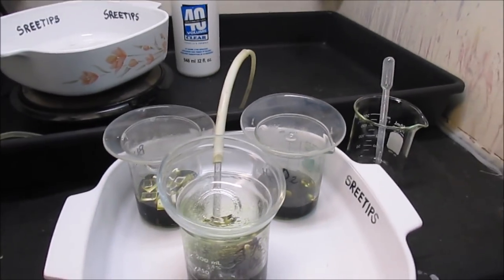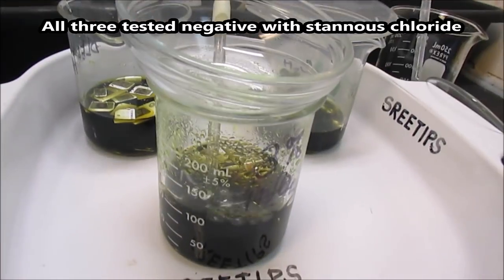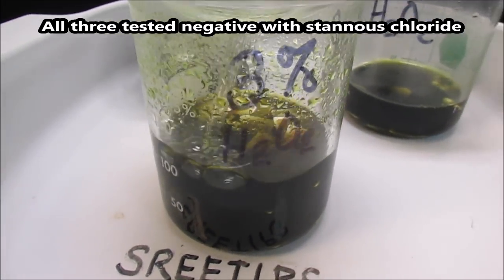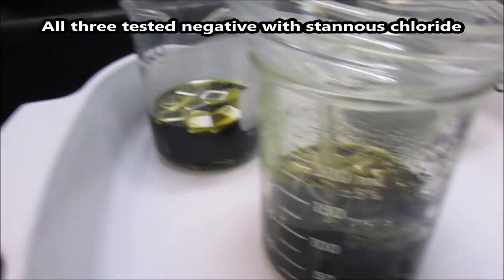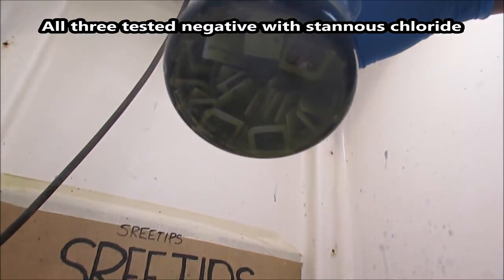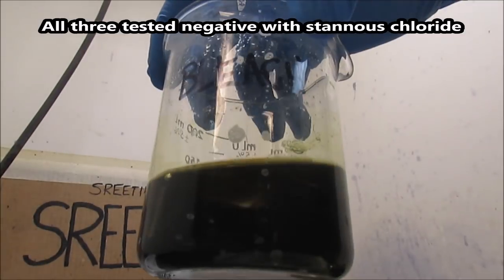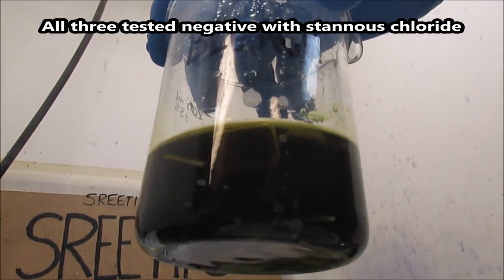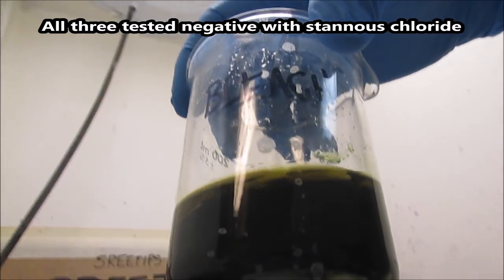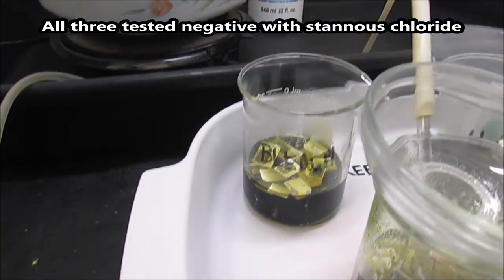Okay, I've let these two experiments sit in the back. I set up a third one here where I used some 3% hydrogen peroxide in hydrochloric acid. Here's the bleach. And as you can see, I can see some little specks of gold in the solution there, but there's some precipitate down there that's formed, and the solution looks real dirty, so I don't think I'm going to use that method. I don't think I'm going to use bleach.